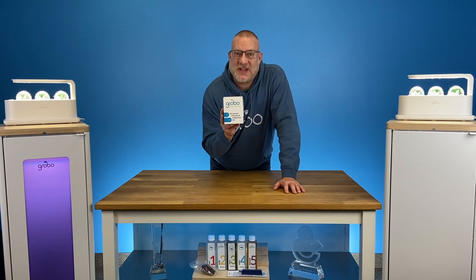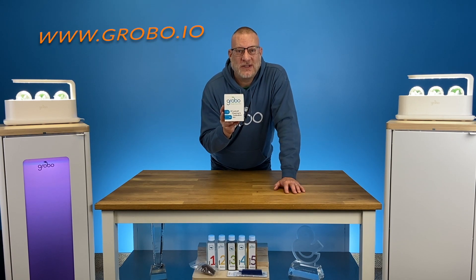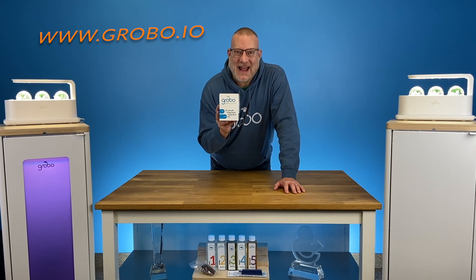So there you are growers, that's what's in the box. They're available on our website grobo.io. Go grab one, keep yourself clean, and calibrate it.